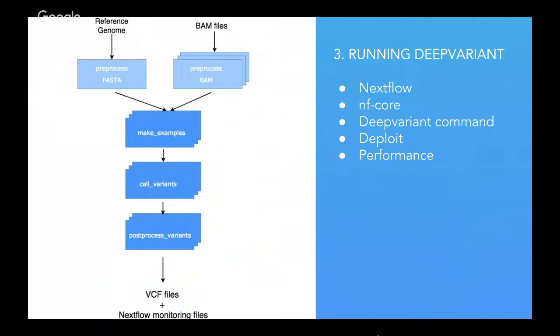Phil, one question. How did all these boxes, all these steps, initially look, and how did you have to put them together to make them runnable? Okay, so Google DeepVariant is already available on GitHub, and that's where you can find all the information for it. There are multiple ways to run it, one of them is through a Docker container. As I'll talk about later, Nextflow has built-in support for Docker, which is super useful because it makes it extremely easy to plug in all these containers developed by Google, right? Yeah, exactly.